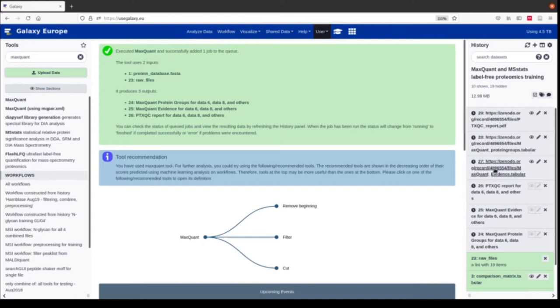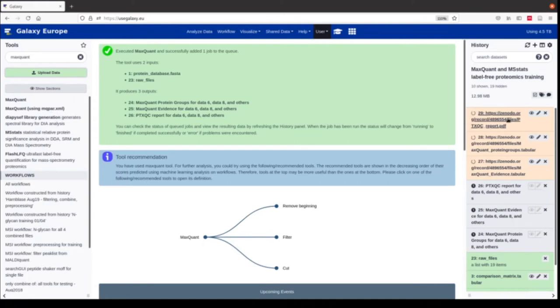In the evidence file we have the feature level data. In the protein groups file we have the protein level data. In the PTXQC we have the quality report with many different plots that visualize the quality and properties of the data. Normally that's a separate R package, but we have directly implemented it into the MaxQuant Galaxy tool because it's made for MaxQuant and it's really helpful to get a quick overview of the data.